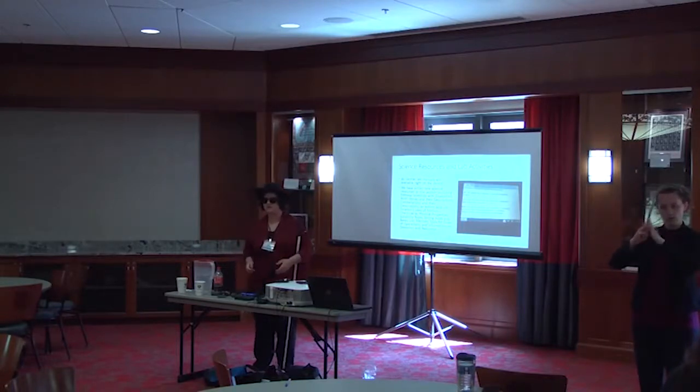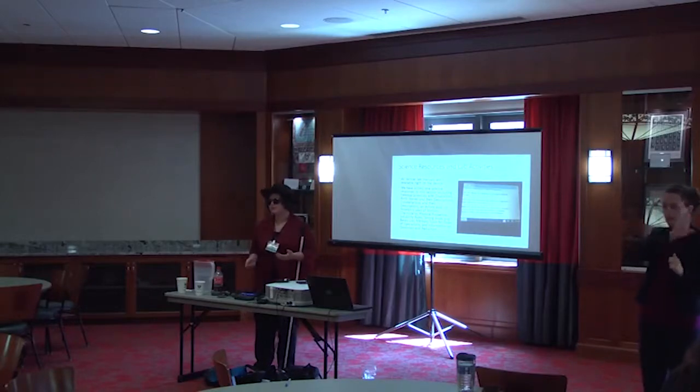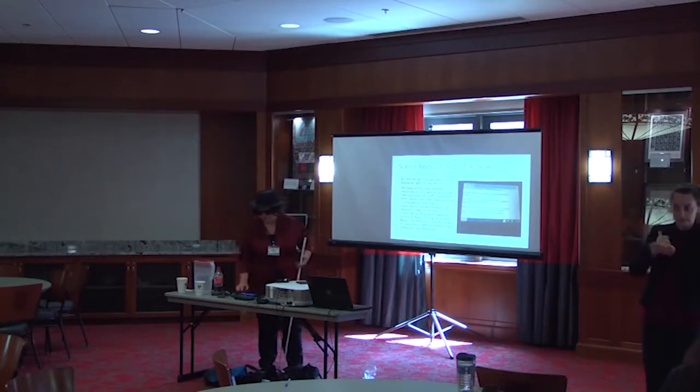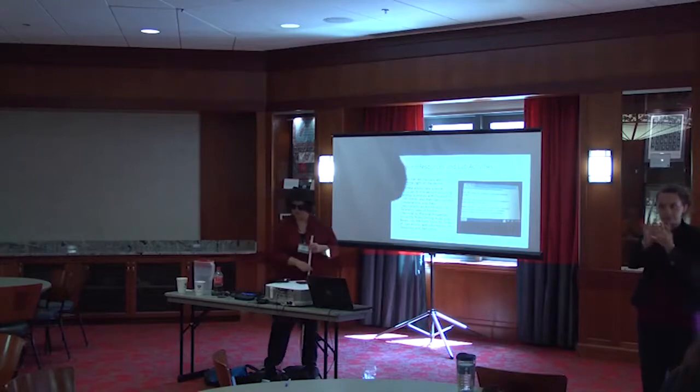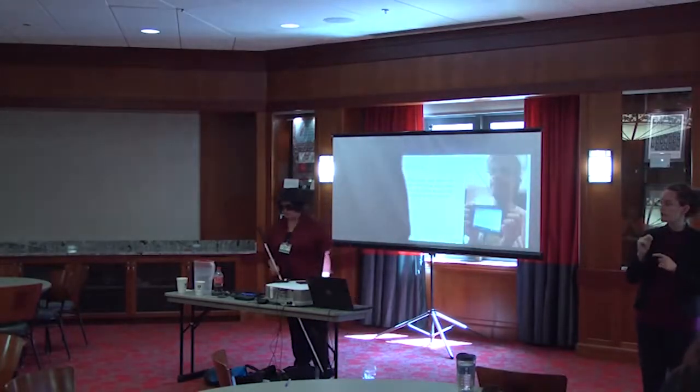Can you change the voice on it? So right now, that's another one of the top things, because this is off of a thing called eSpeak, which isn't the most pleasant, most human sounding voice. So we're working on fixing that. Right now it does have the option of male or female and pitch change for if you have hearing loss at a certain frequency.